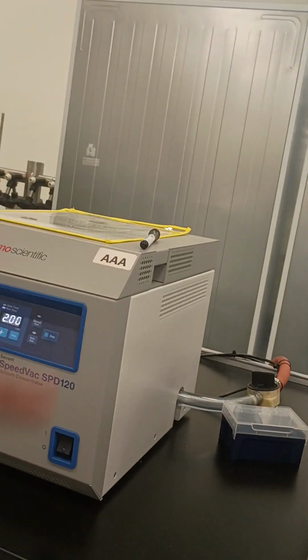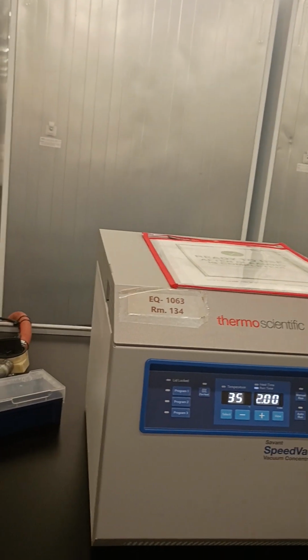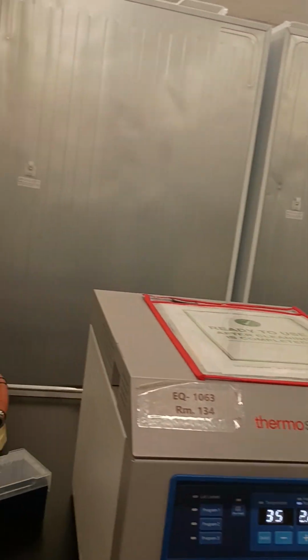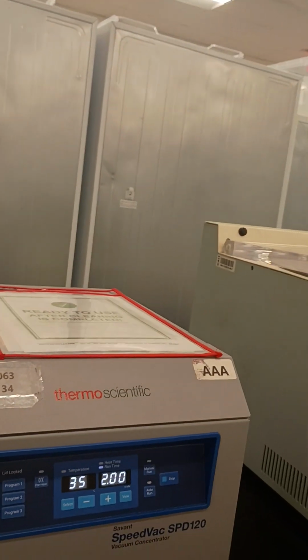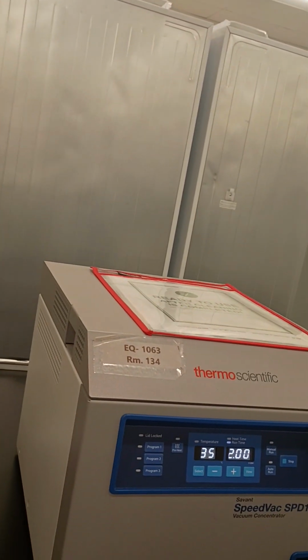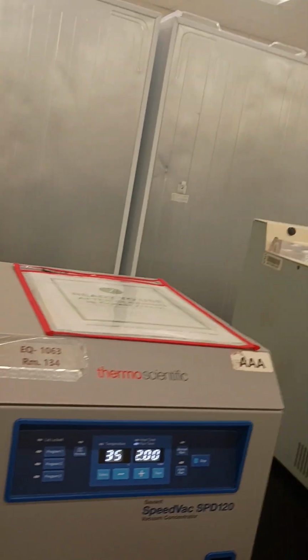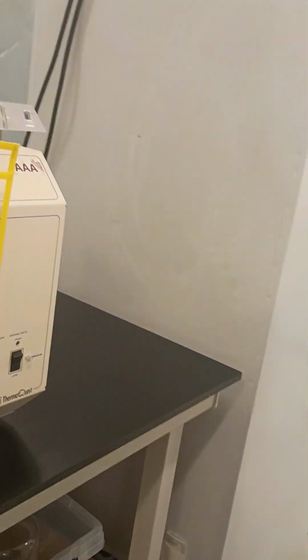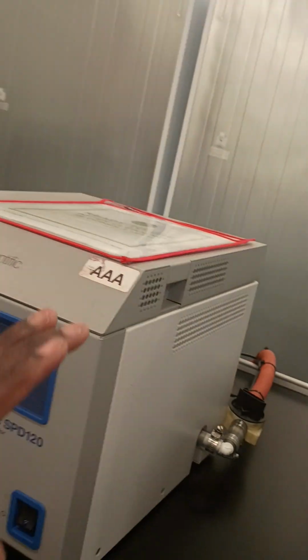These are for Miriam, for the amino acid. She concentrates, dries, and everything. Normally I keep up with these with her. If they're running, it says run, so don't touch it. If it's ready and everything is done, it's ready to use. So you don't really have to worry about these, because I'll take care of them before I leave, and if needed I might ask you, hey, can you do this or that for me? Today they don't have anything, so there's really no example to show.